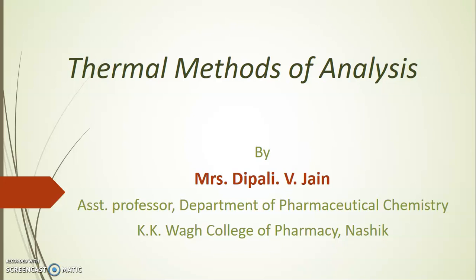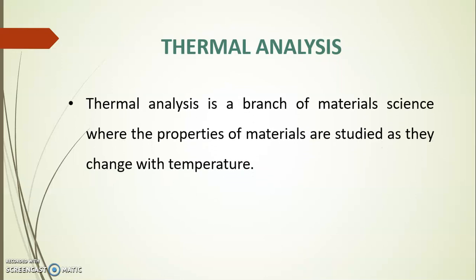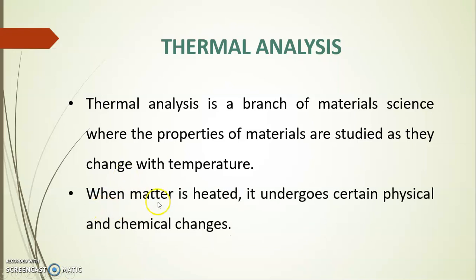Today we study about thermal methods of analysis. So let us start with the definition of thermal analysis. So what is meant by thermal analysis? It is the branch of material science where the properties of materials are studied as they change with temperature. When matter is heated, it undergoes certain physical and chemical changes.